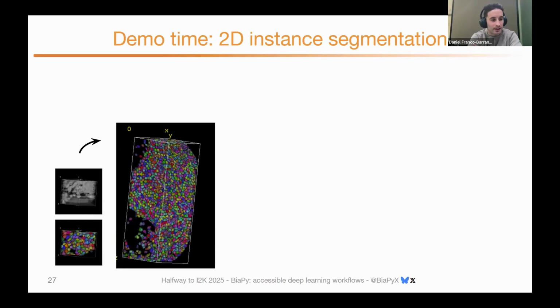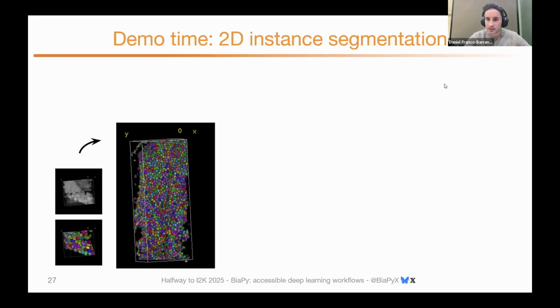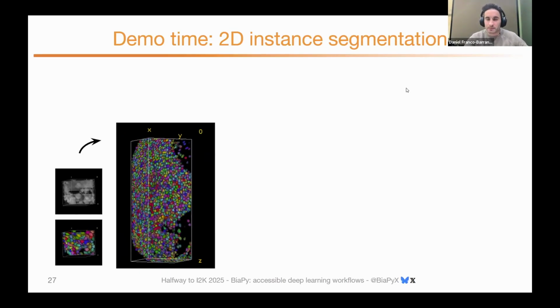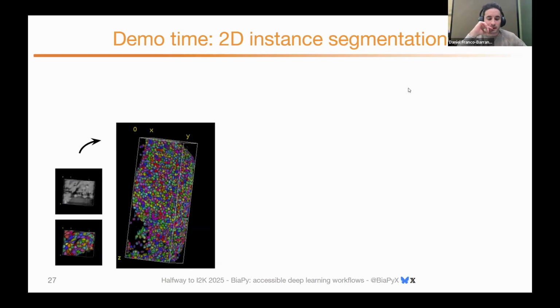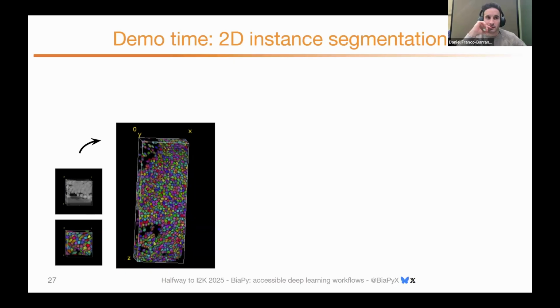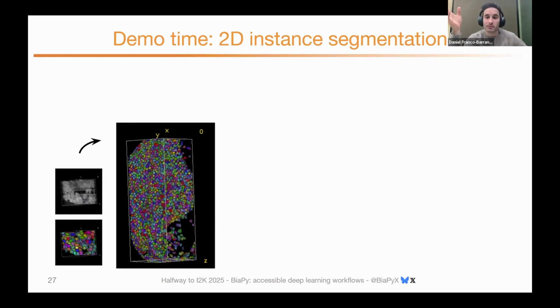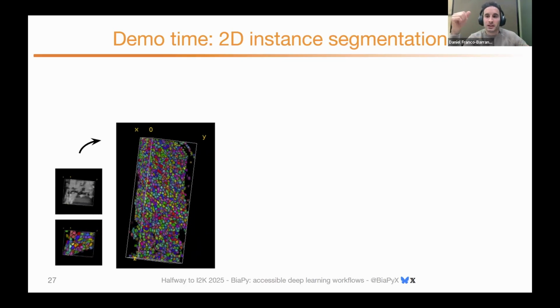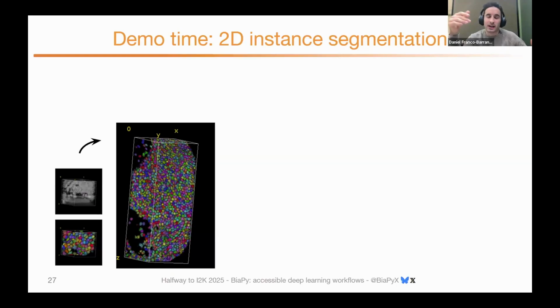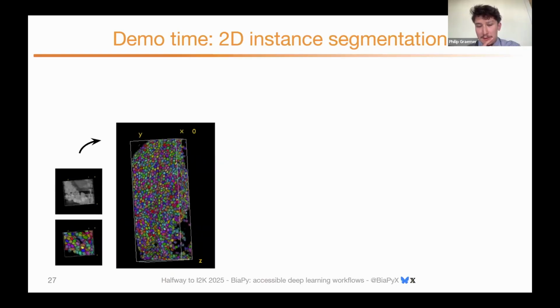No. I mean, we have more than UNets. We have transformers and other kinds of models too, but we are not planning to add any model based on SAM because you need prompts. This is an automatic pipeline, right? Those models have an option of automatic instance segmentation as well.